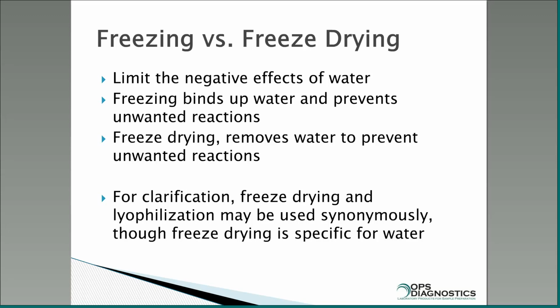And when we moved into our new location about 6 years ago, I found out it cost me about $300 a month just to run the freezer. So once you freeze dry, you don't have to worry about that. You can keep your samples in a refrigerator. It's much more cost effective to store than using some very low temperature vehicle with liquid nitrogen or a cryogenic freezer.